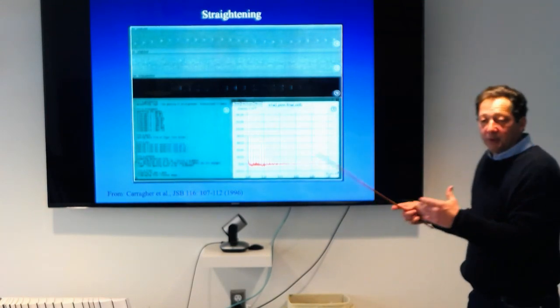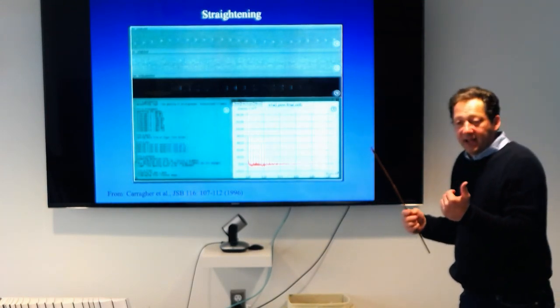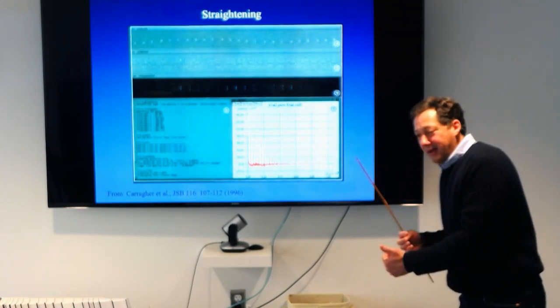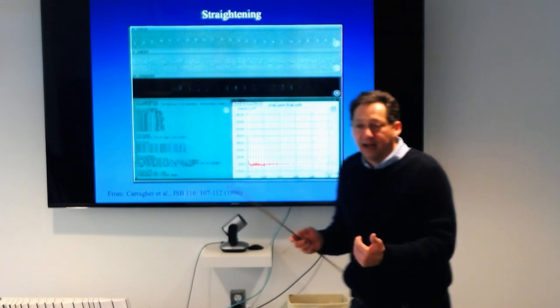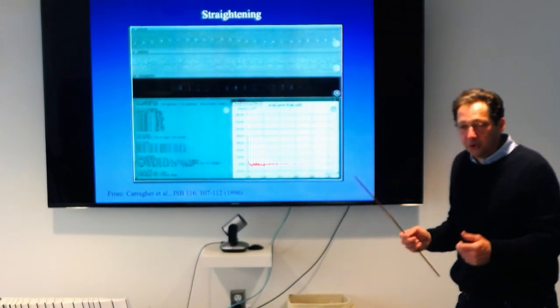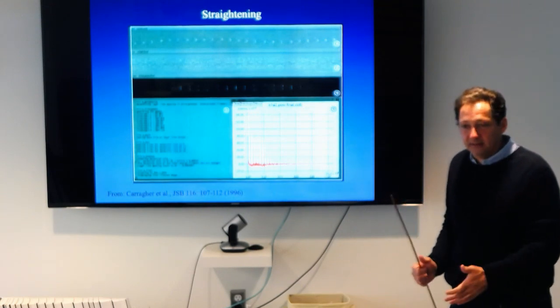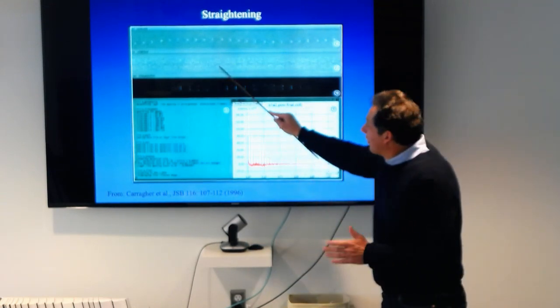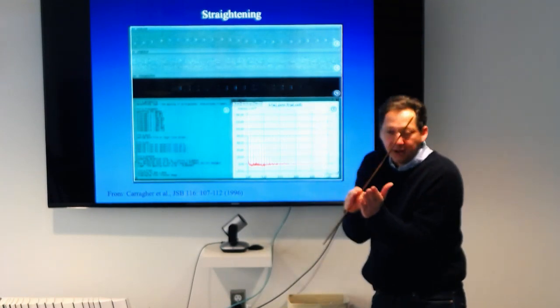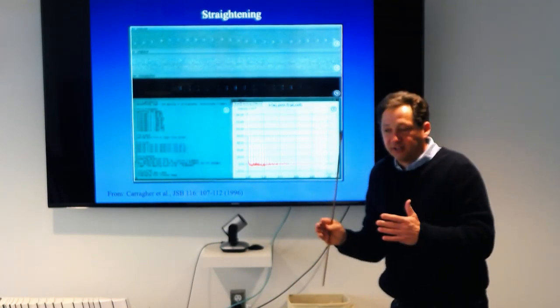That was the way we did it, but of course that creates a lot of artifacts. One thing we have to be mindful of is that at this time you were getting a 20 angstrom resolution. That was great. But there are a lot of artifacts you can imagine when you reinterpolate. There were some areas that are going to be compressed, some areas stretched.